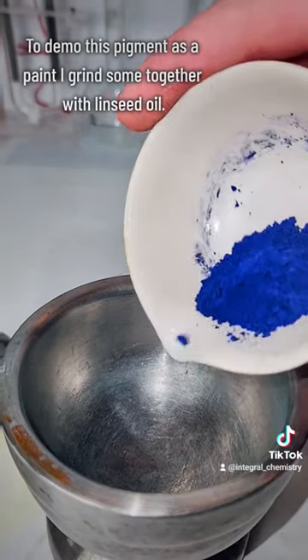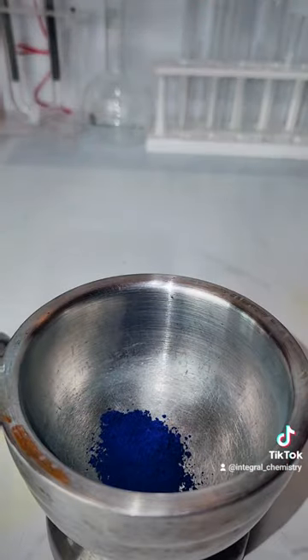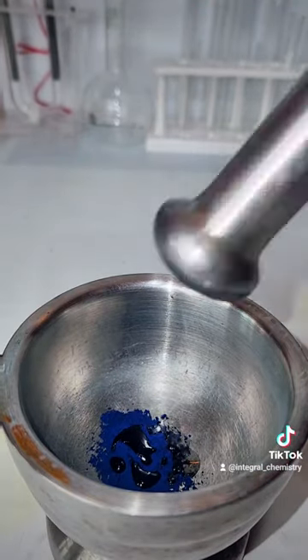To finish this video, I'm going to do what I always do and grind some of this pigment together in a mortar and pestle with some linseed oil to make an oil paint.